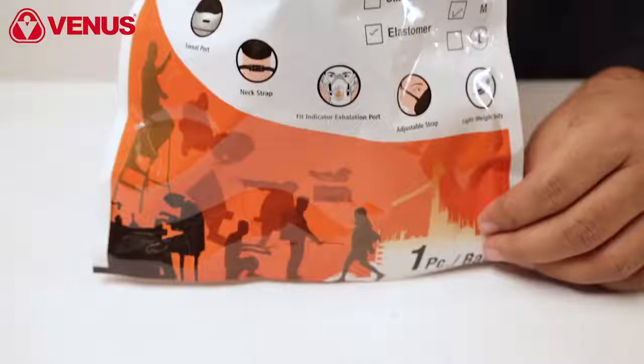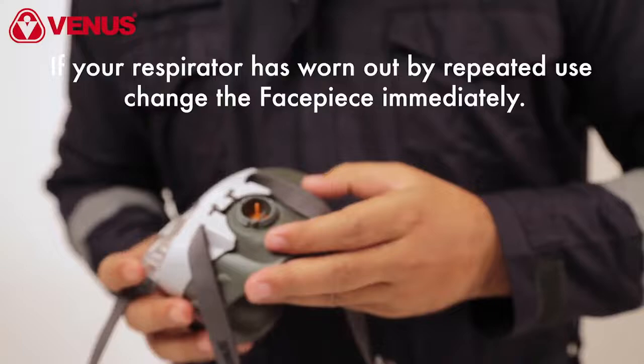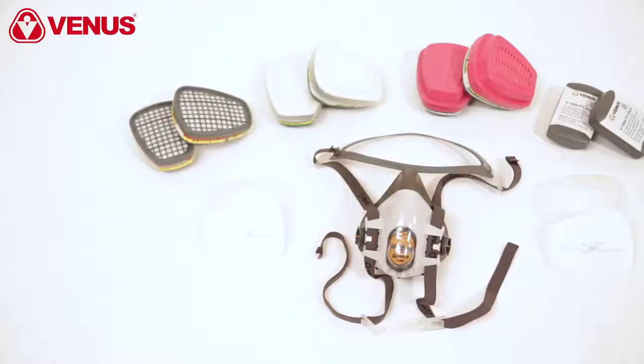Remove the respirator from the box and bag, and inspect the respirator and its components for damage prior to each use. If your respirator has worn out by repeated use, change the face piece immediately.